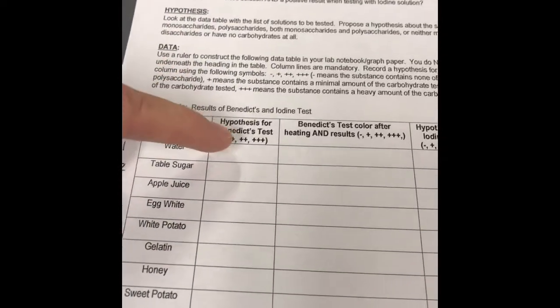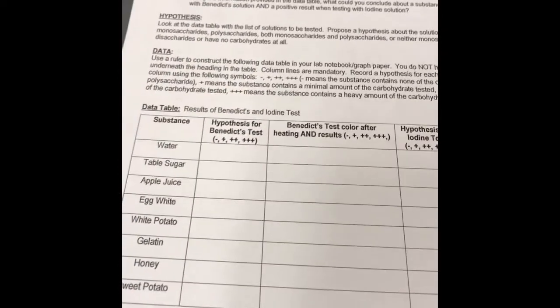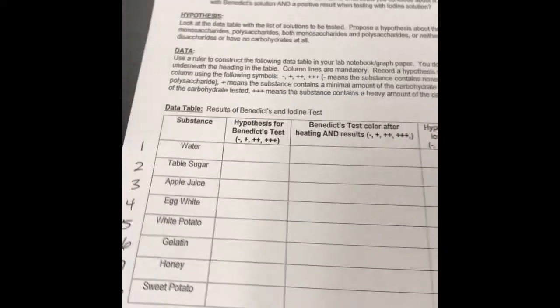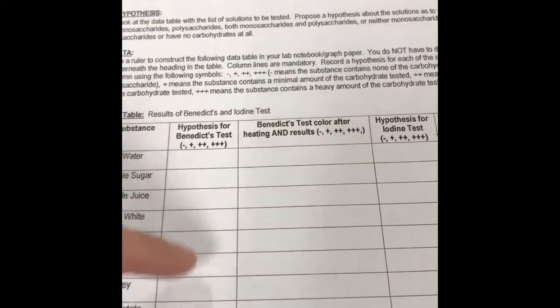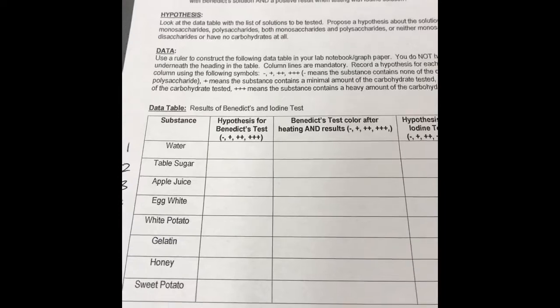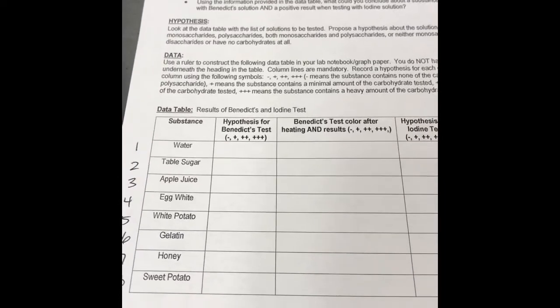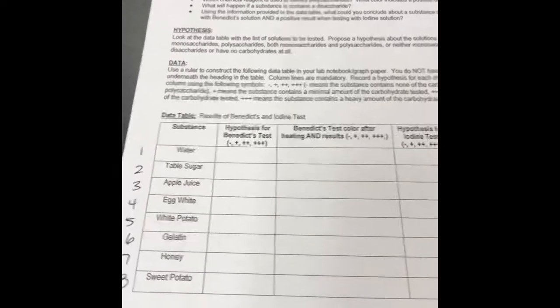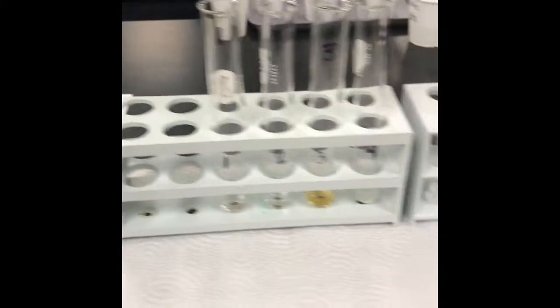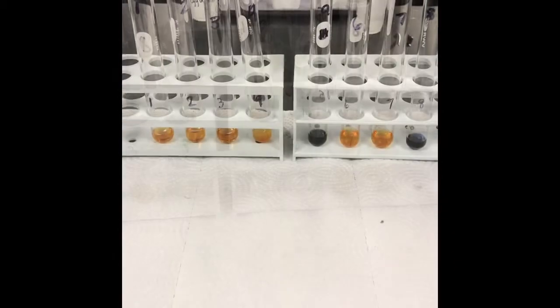Just like you see on your data table, the darker the color, the more positives we're going to assign. So before we begin, if you have not filled out your chart, I want you to write a hypothesis right here. Put a negative if you think the substances do not contain polysaccharides, and then a 1+ if it's a little bit, a 2+ if you think it's a medium amount of polysaccharides, and then a 3+ if you think it's a heavy amount. All right, so I'm going to add my iodine.